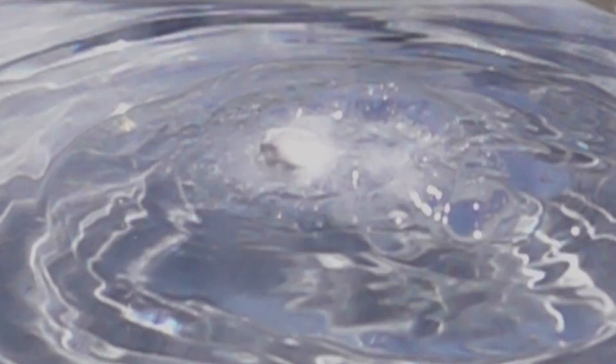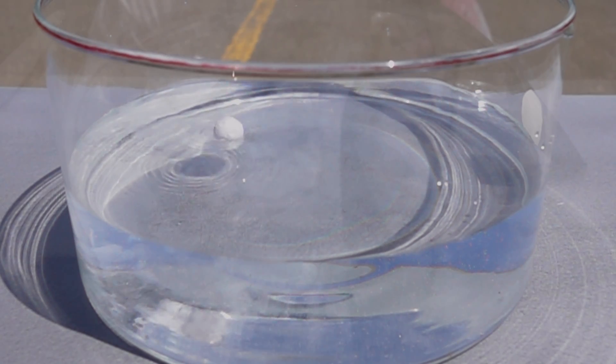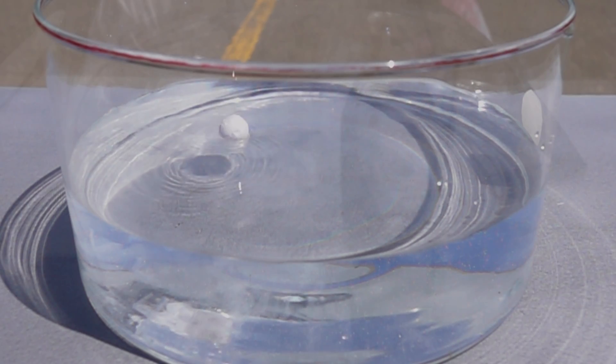Now in this reaction, the sodium merely skidded across the surface of the water, generating sodium hydroxide and liberating some hydrogen gas, but no explosion. As you can see, not much happened for that particular reaction. I think we need more.